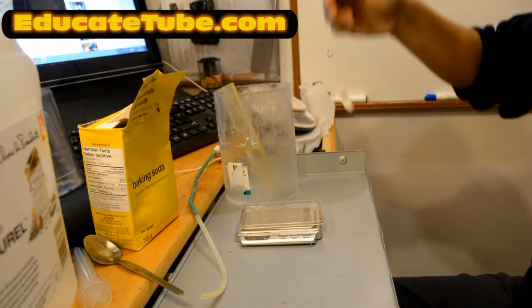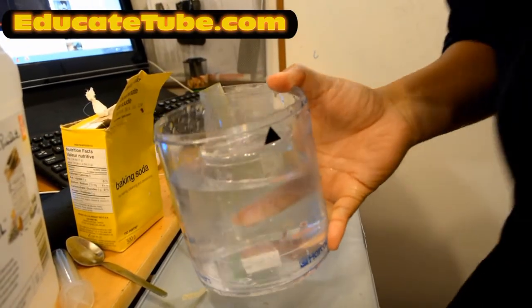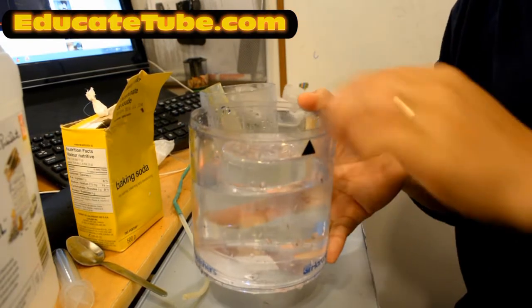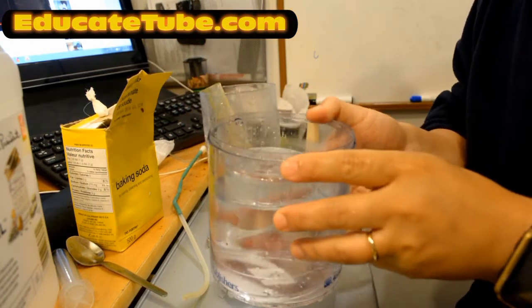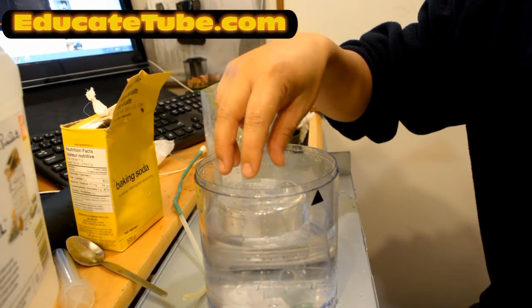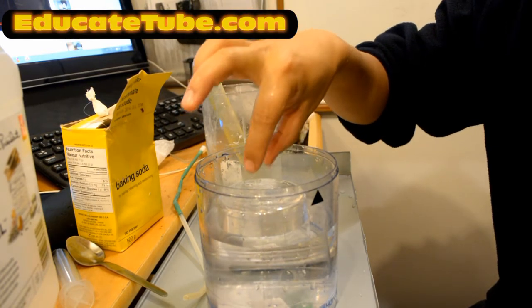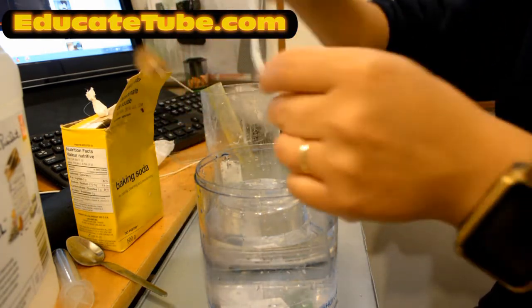Okay, now I'm going to load up the water. Here is the water in a large container, and more water inside this upside down container. It's filled all the way up. This is where the gas will be displaced. When the gases form and bubble up into here, they will displace the volume and the water will be pressed down, and whatever volume is empty with gas would be the volume of that gas inside here. Okay, so here's a tube.